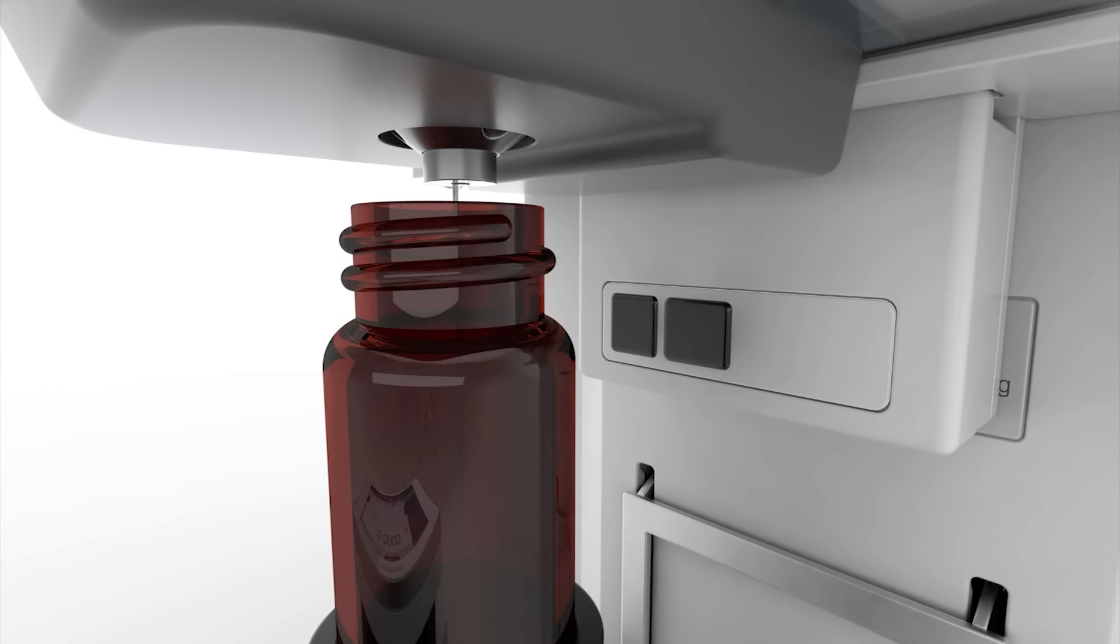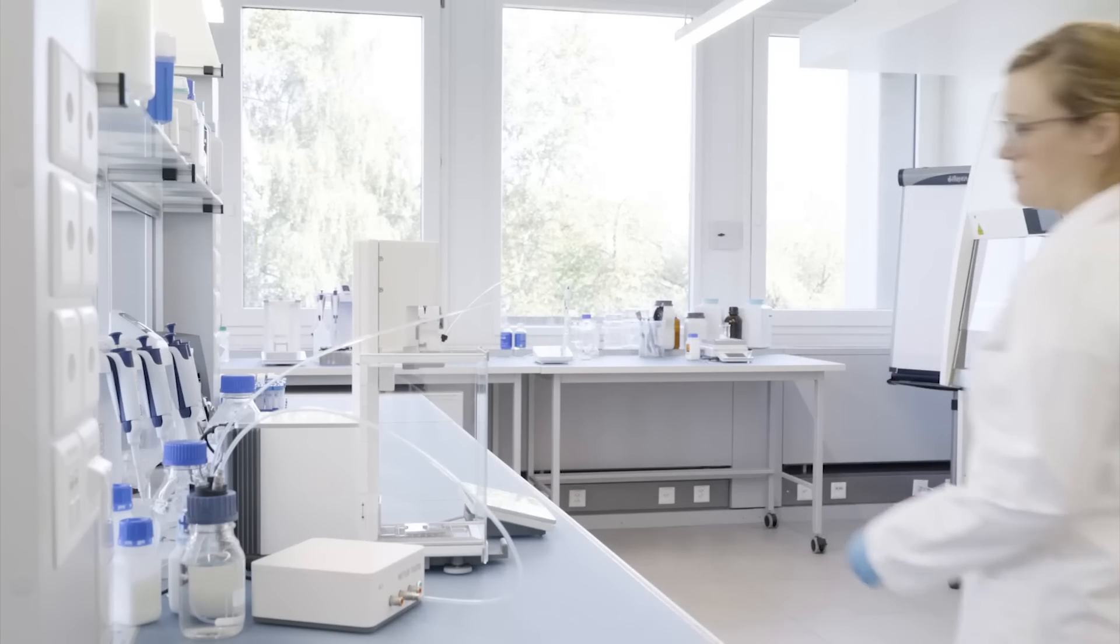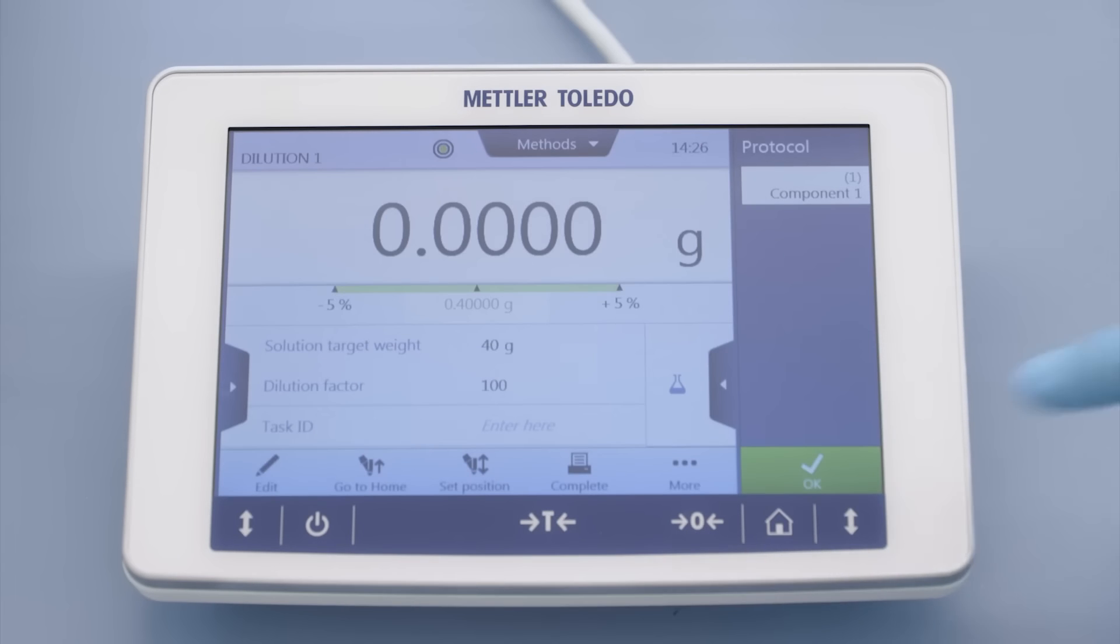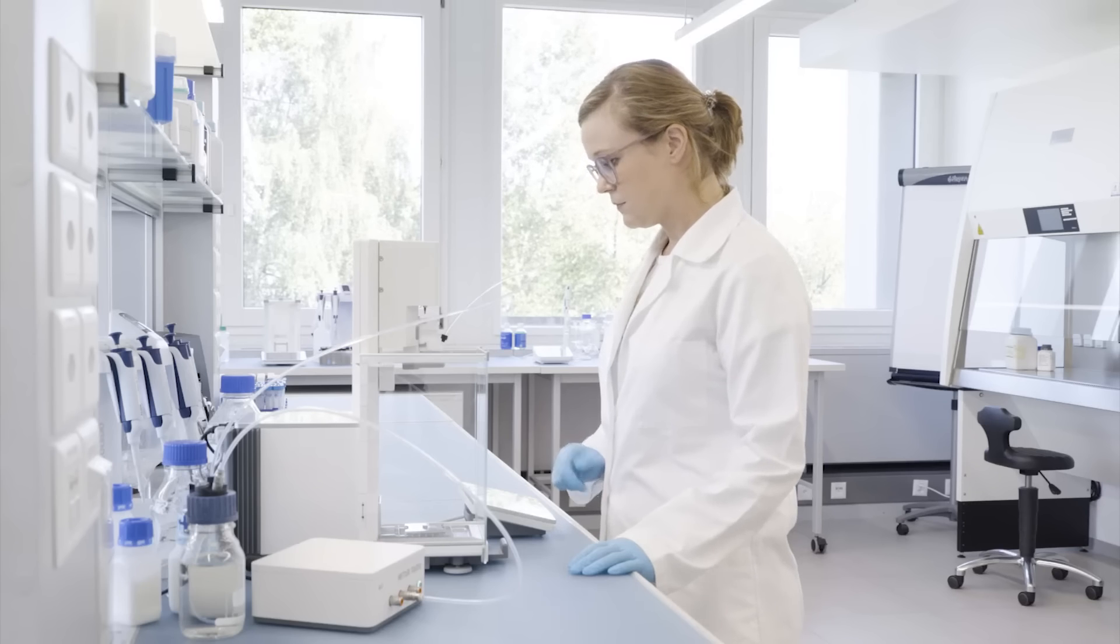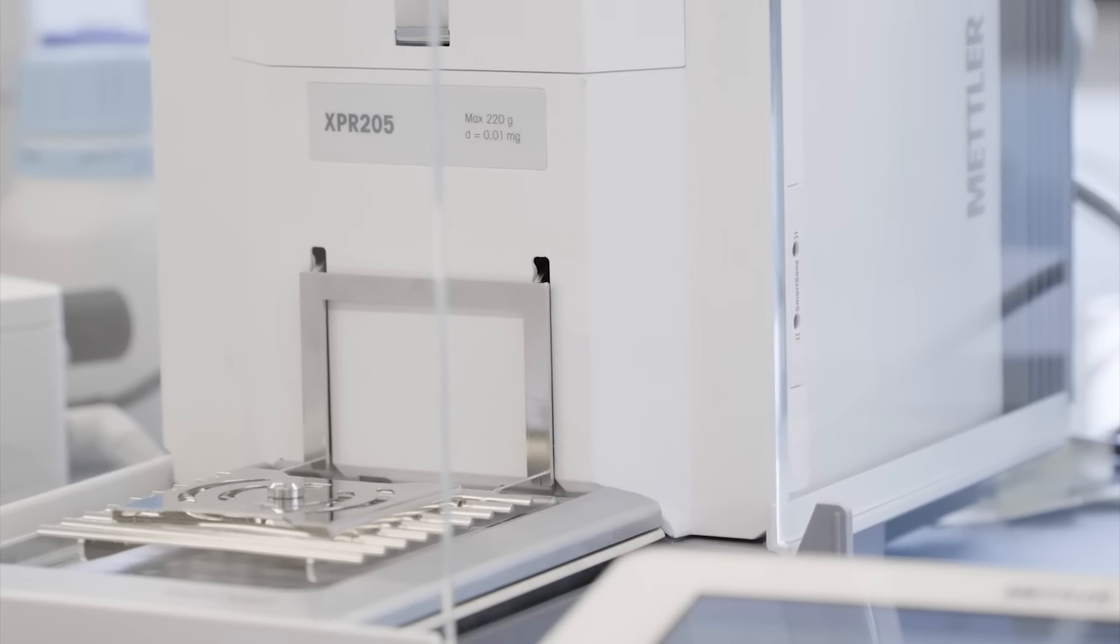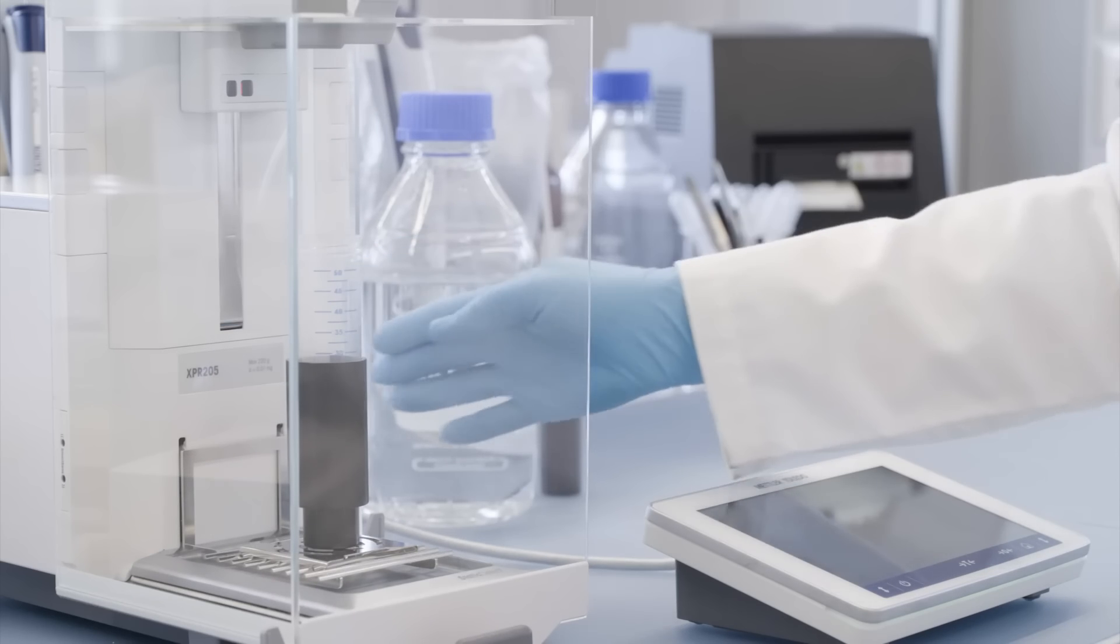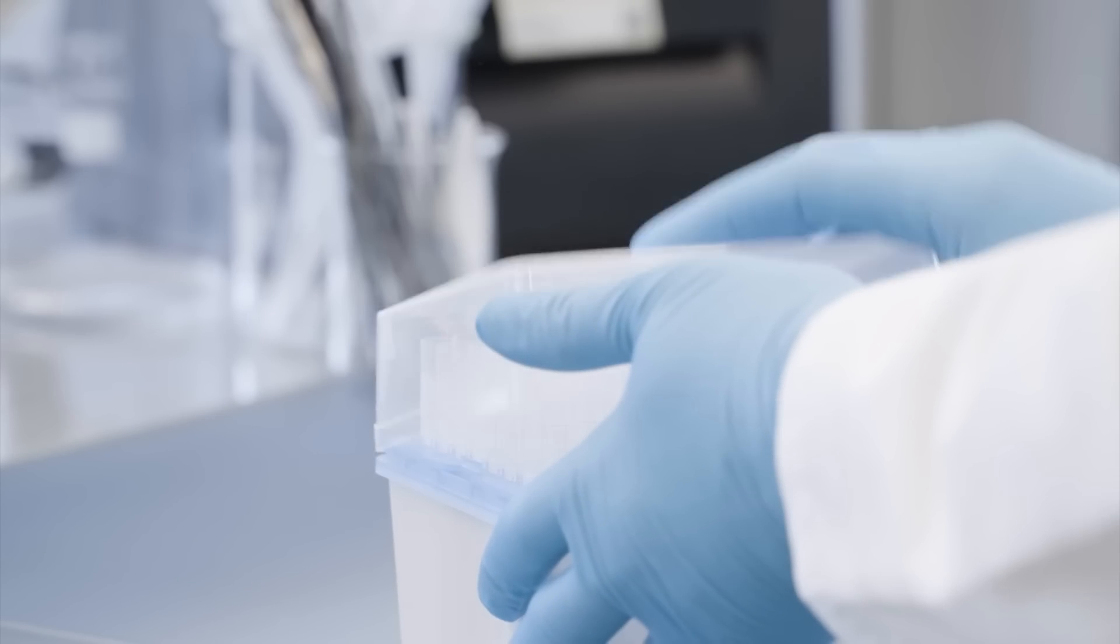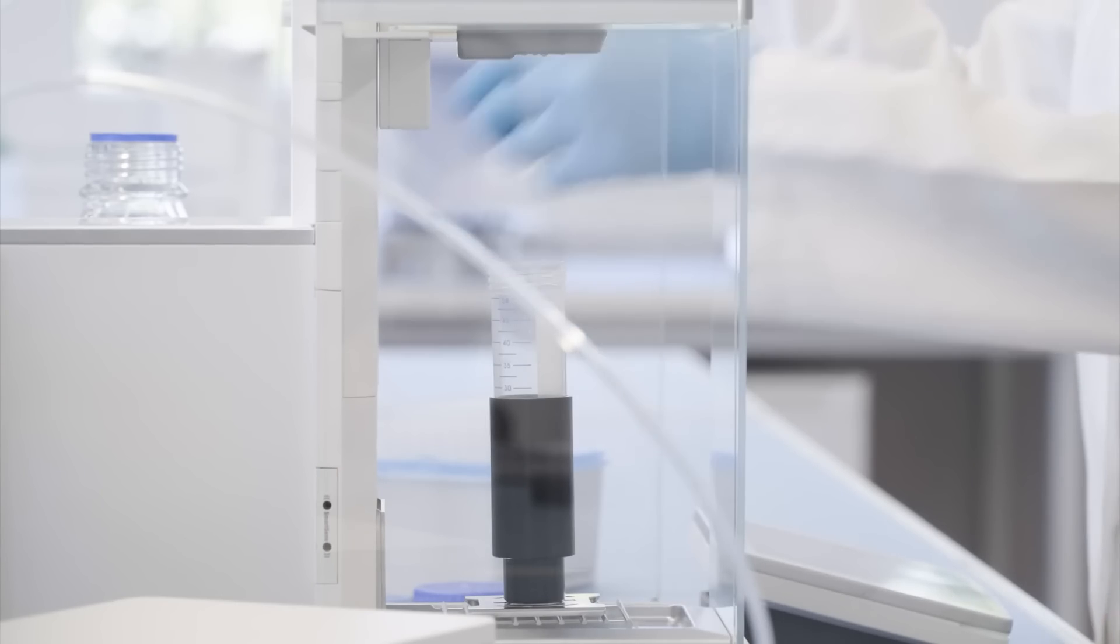The preparation of solutions with accurate concentrations is an essential starting point for many analyses. With the XPR Automatic Balance, you simply start a method on the balance terminal, define the target volume and the concentration or dilution factor, place the container in the weighing chamber, and pipette an aliquot of your concentrate.